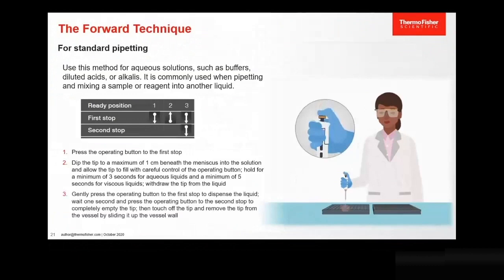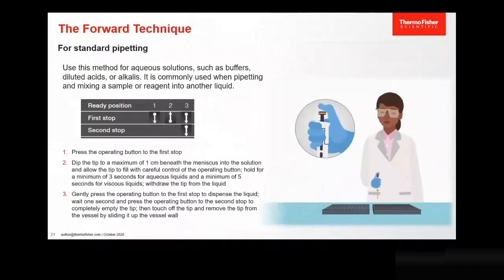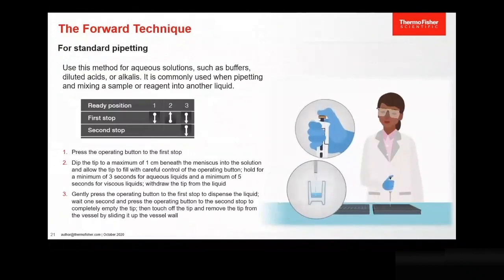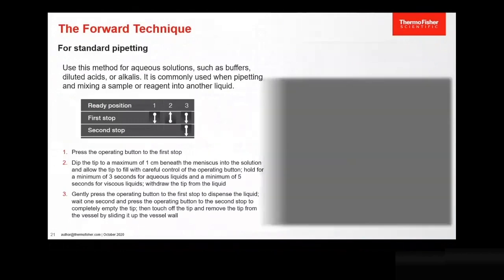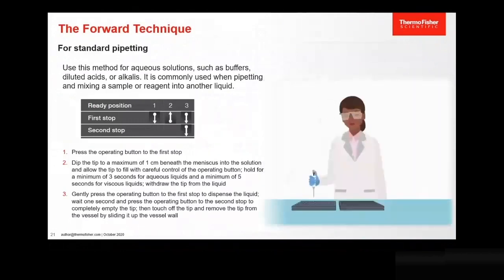Gently press the operating button to the first stop to dispense the liquid. Wait one second and press the operating button to the second stop to completely empty the tip. Then touch off the tip and remove the tip from the vessel by sliding it up the vessel wall.